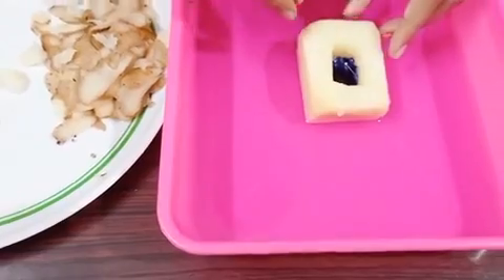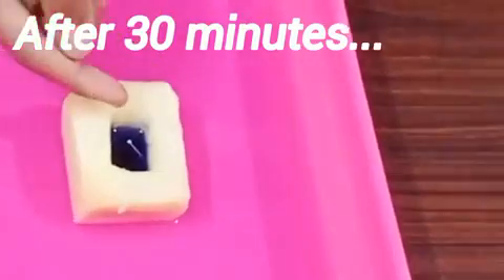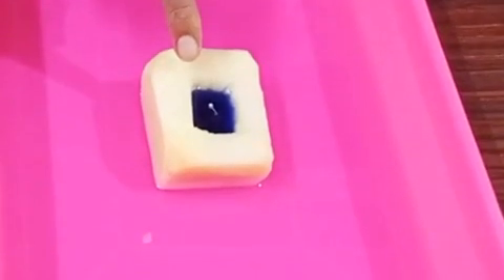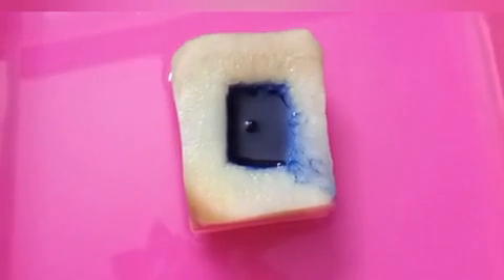Leave the experiment for about 30 minutes. You can see the rise in the level of the solution. After an hour, we can see some more rise in the level of the solution. After two hours, the colored solution is overflowing from the cavity.